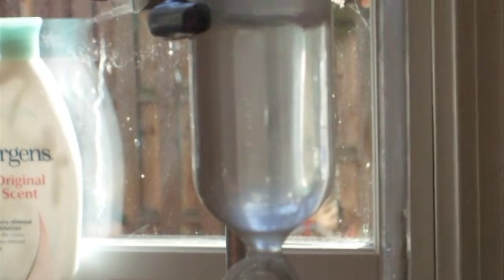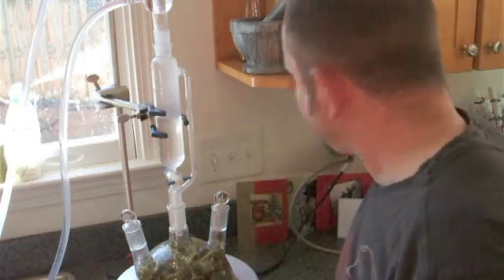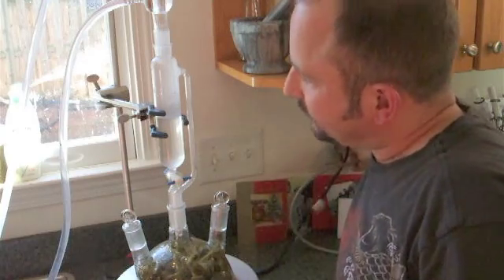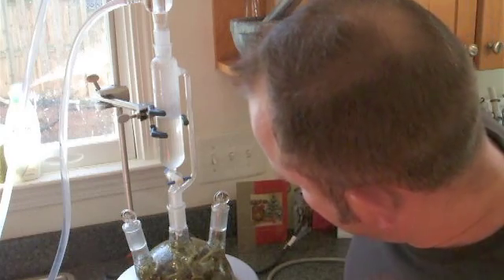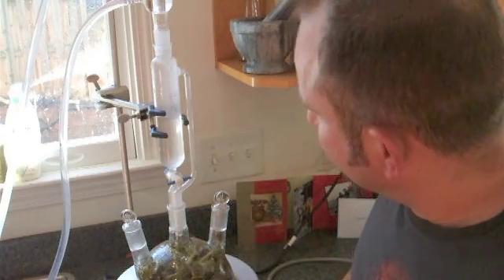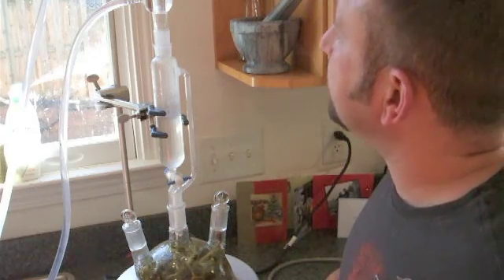Now, if you look carefully in the separatory funnel, you'll see the start of an oil phase, right? Ouch! It's hot. And you'll see some little droplets of oil in there. I'm going to go ahead and disconnect the heater but leave the pump going so that it can start to cool down. It's been running about 10–15 minutes. This is all nice and brown in here, so I'm assuming that we've gotten the best part of what we're going to get today.